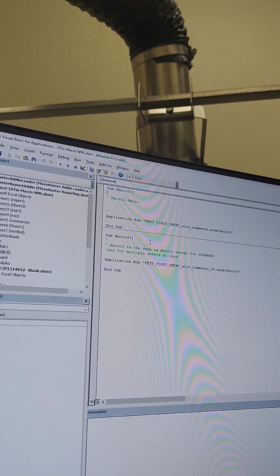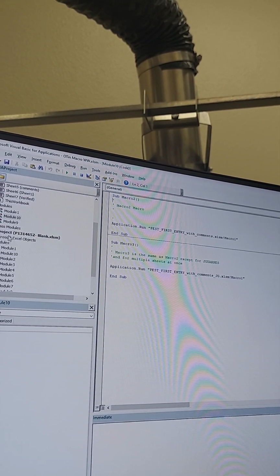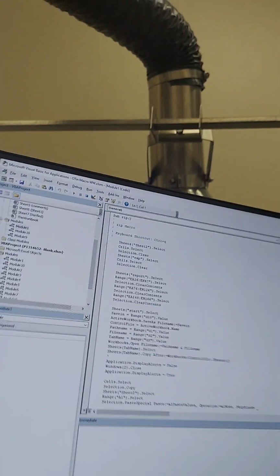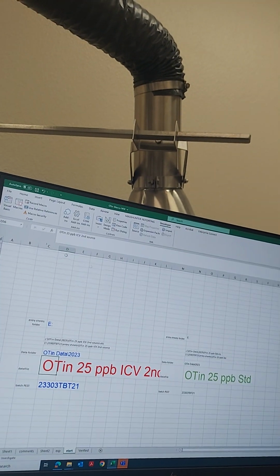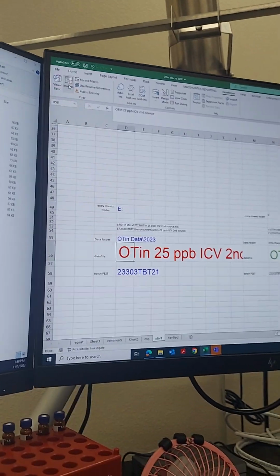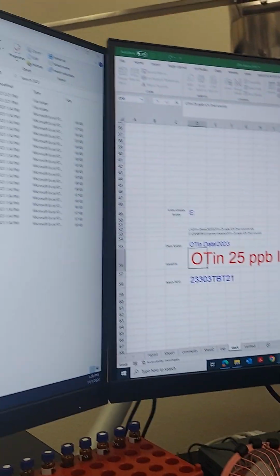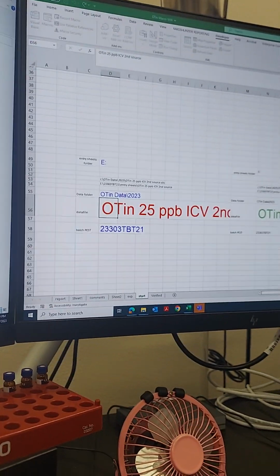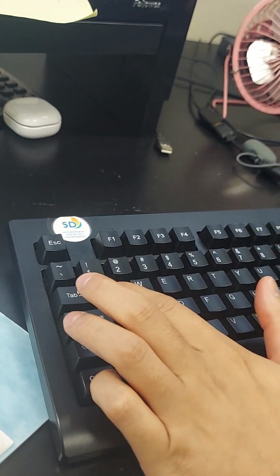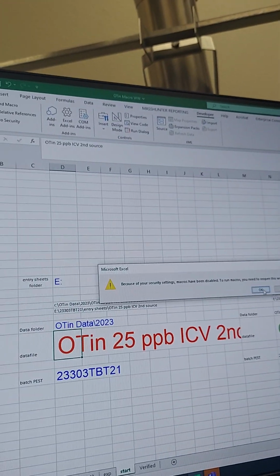Microchip, corner. So it's not that one. Control Q. Oh, it's not C. It's Q. Control Q. Yeah, because Control Z is not good. It's different. It's not opposite. So that's Control Q. Because I didn't enable it.